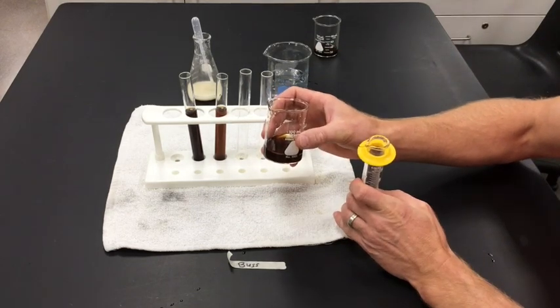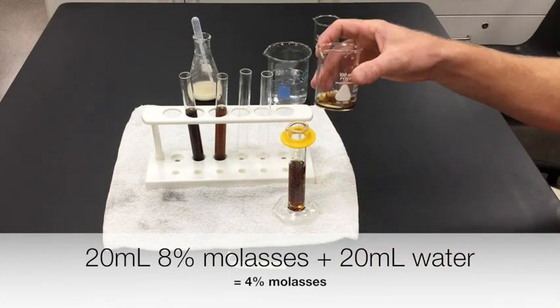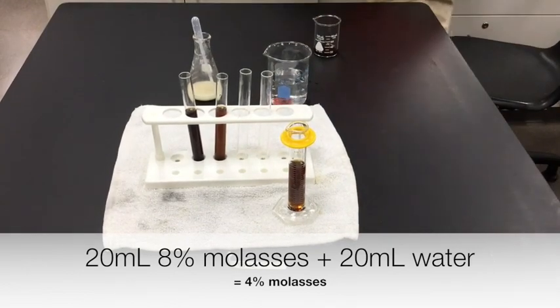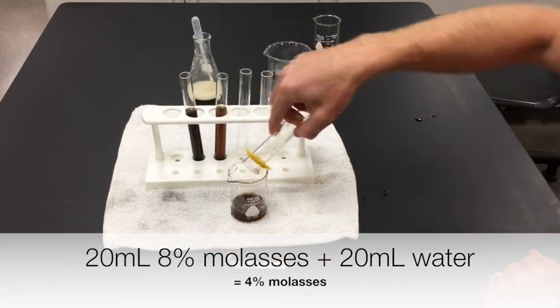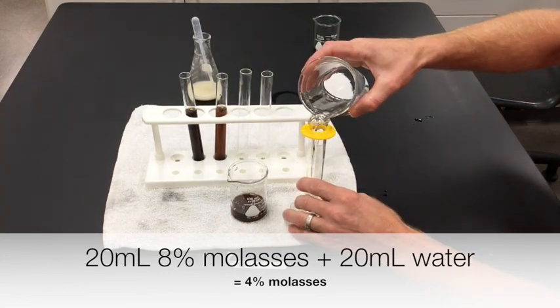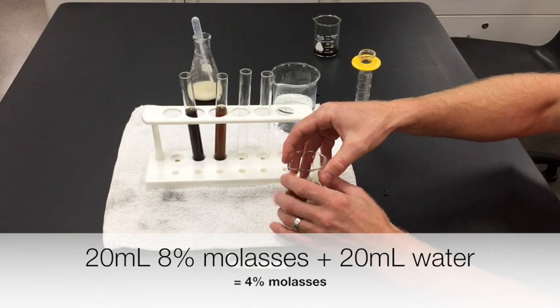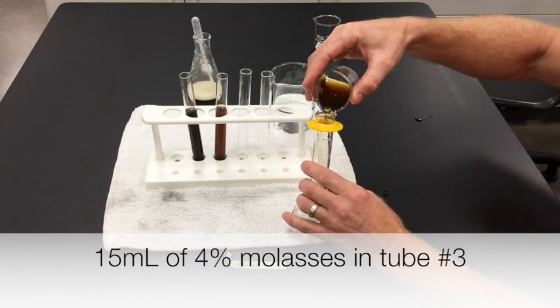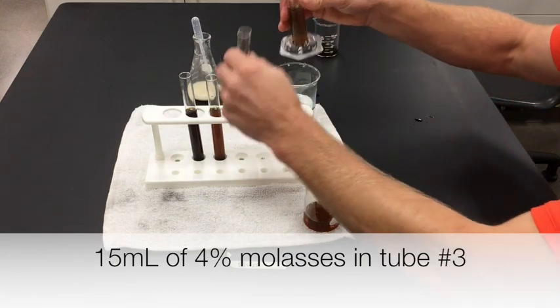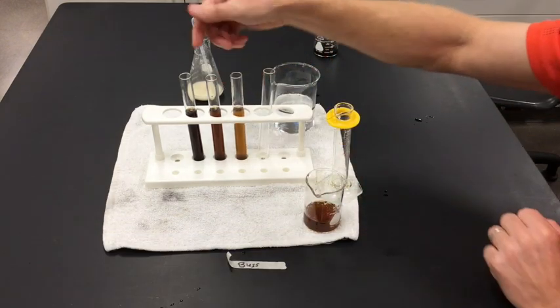I can do that again. I'm going to take my dilution and do another 20 milliliters into the graduated cylinder, rinse it out and use it. We take 20 milliliters of the molasses dilution and 20 milliliters of water, mix it up, and again measure 15 milliliters of that into the next test tube.